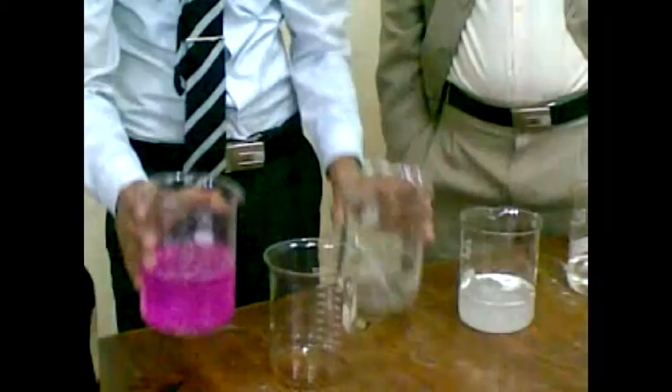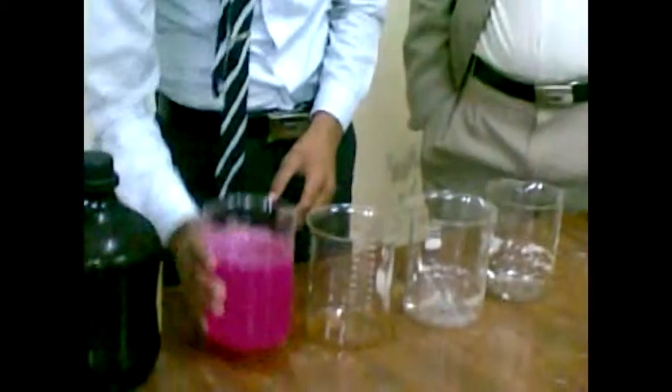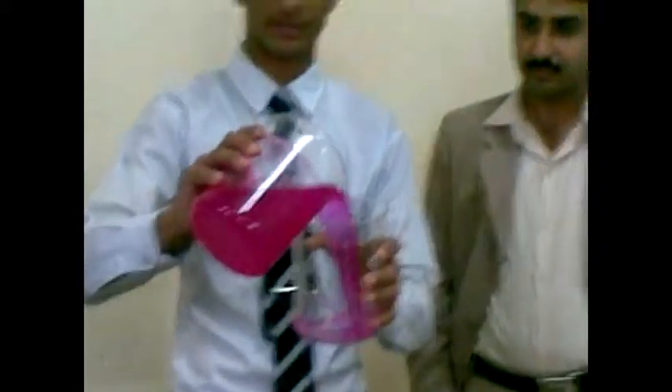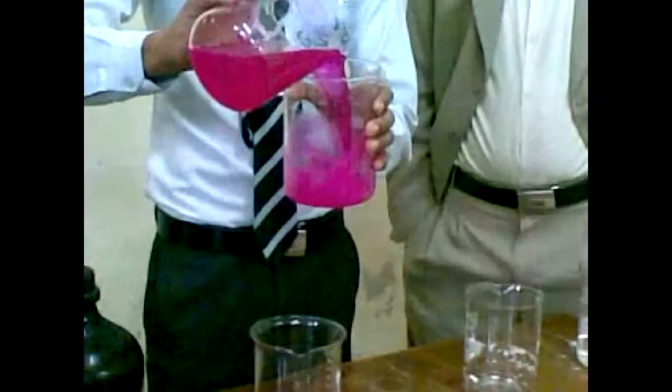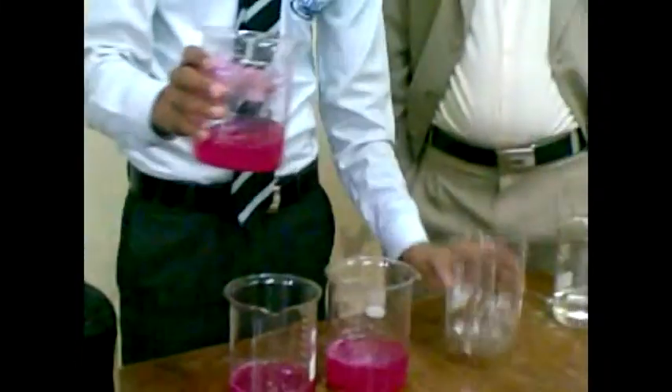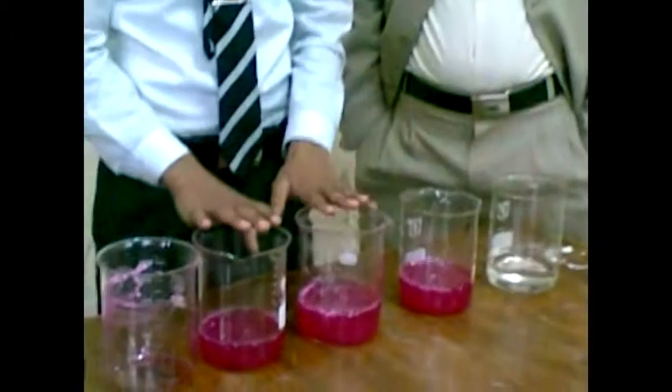Now the color of water has changed into a pink color due to the indicator. Now it is the relation between the indicator and the water. Now I return this pink-colored water into the first beaker, then into the second beaker, then into the third beaker. The pink color is now present in this beaker.